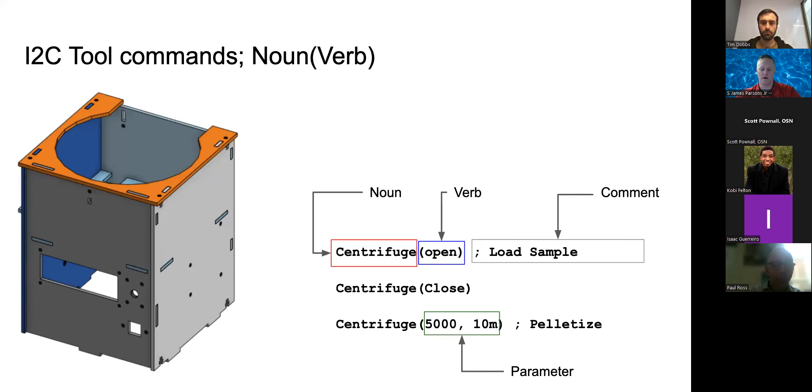The I2C tool commands are designed to be plain English: noun, verb, then comments. For example: 'centrifuge open,' 'centrifuge close,' 'centrifuge 5000 10M' — where 5000 is RPMs and 10M is the time duration. This I2C traffic is sniffed and automatically tracked in the laboratory notebook, so if you say 'PCR for 15 minutes,' that command is sent and automatically added to the lab notebook.